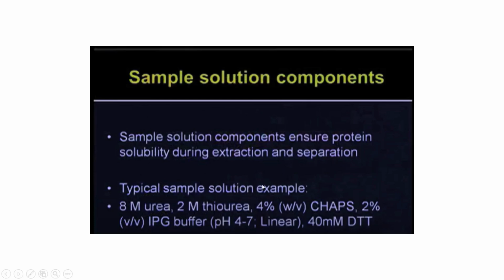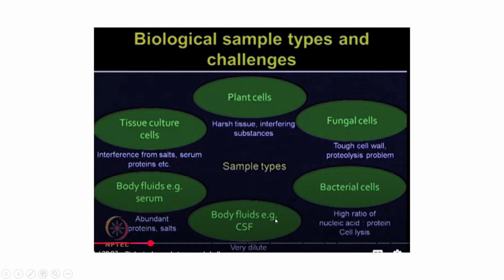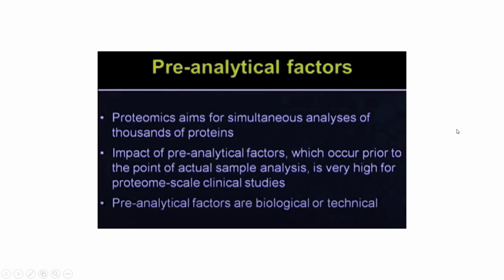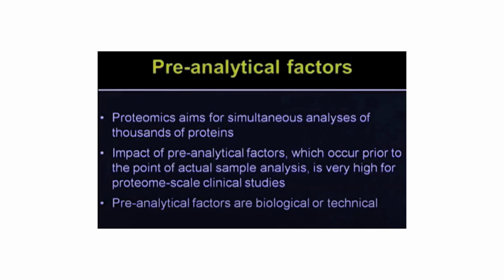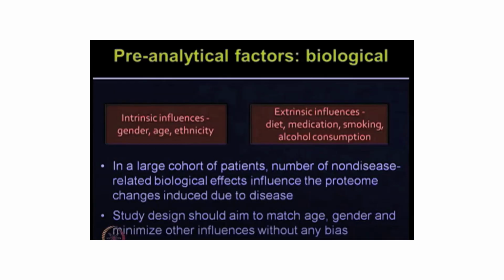Then about what all you need to add into the sample for preparing, depending upon different sample types. And this is in terms of clinical studies, what all factors you need to consider, like pre-analytical factors.